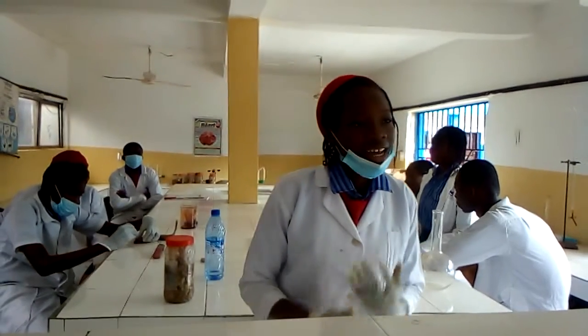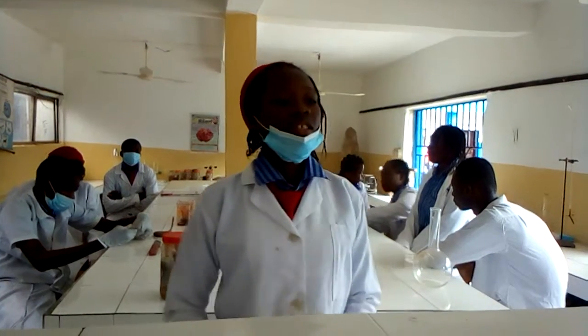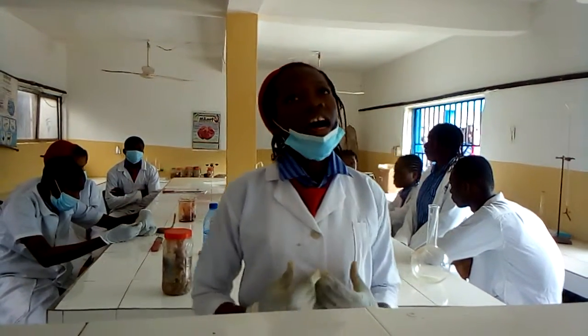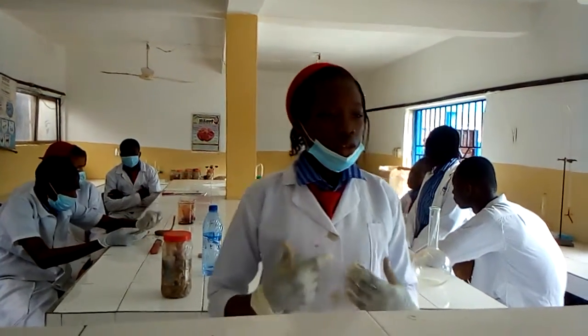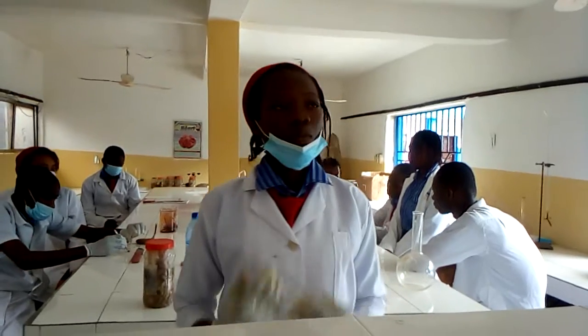After placing it on the dissecting board and holding it with the dissecting pin, we slit the skin through the center of the chicken down to the level of the anus, so that we are able to study the internal organs properly.